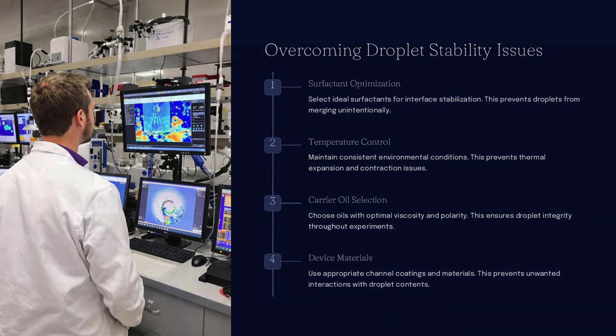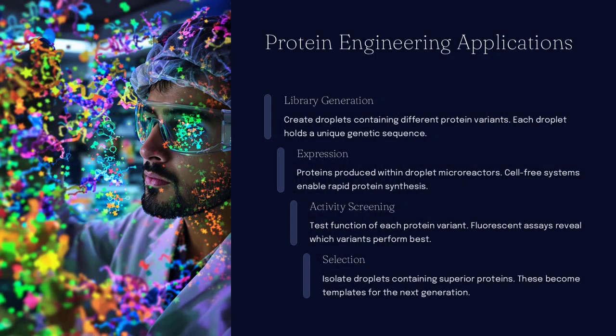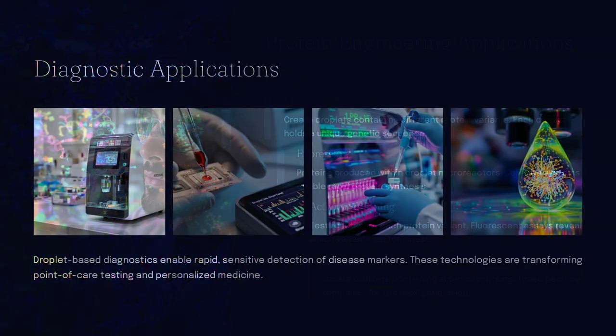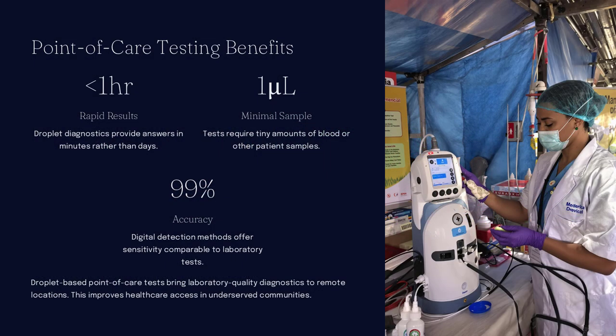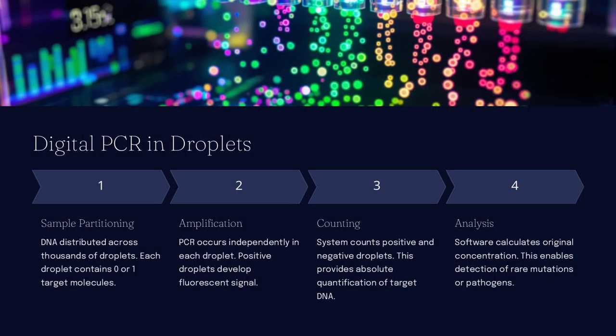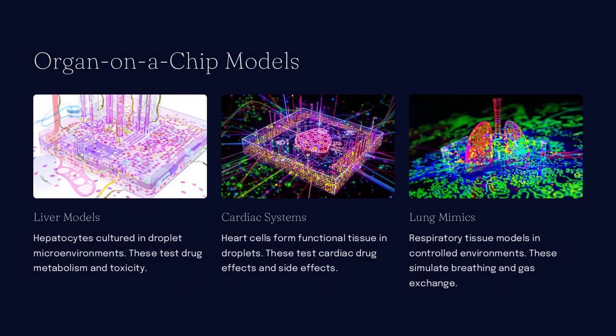Droplet libraries also enable precise control over experimental variables. By altering the size, composition, or temperature of individual droplets, researchers can systematically investigate how different factors influence a reaction. This high level of control is critical when dealing with complex systems where multiple parameters interact. In environmental science, for instance, droplet libraries can simulate micro-scale chemical reactions that occur in natural waters, providing insights into pollutant degradation or nutrient cycling.